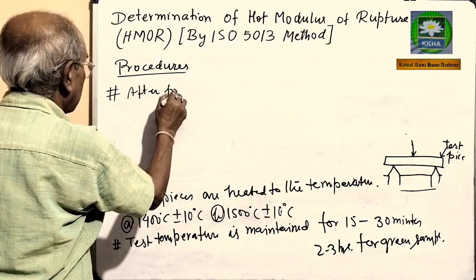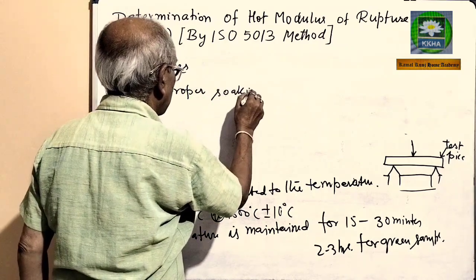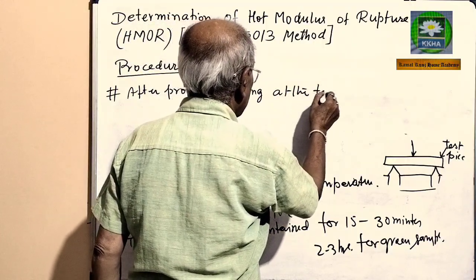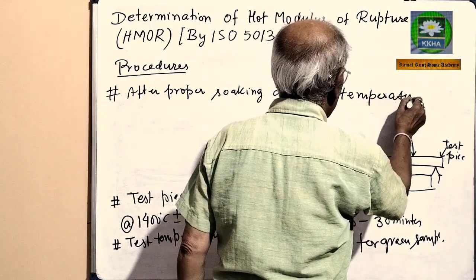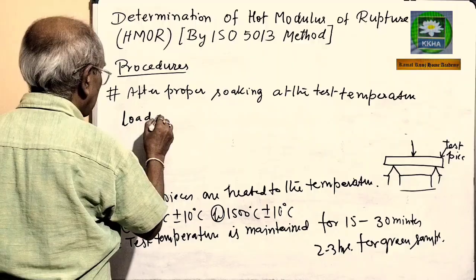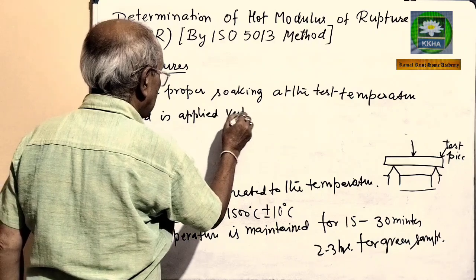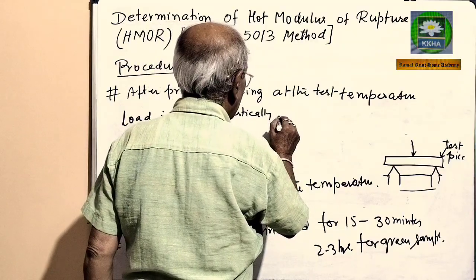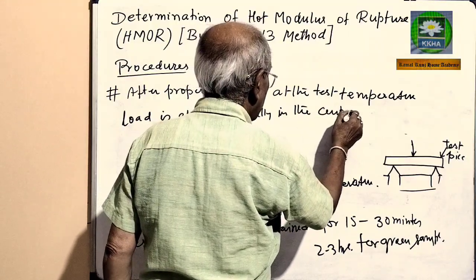After proper soaking at the test temperature, load is applied vertically in the center of the test piece.